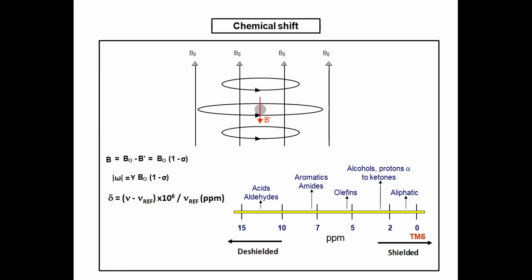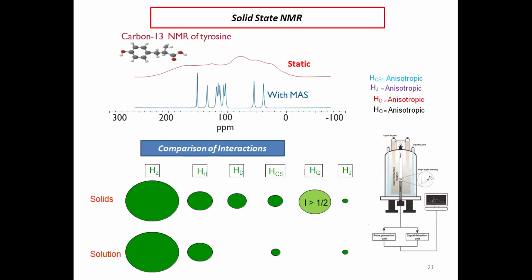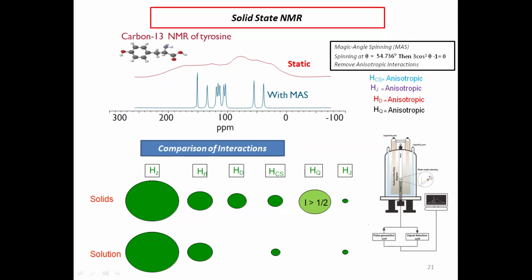So there is another part which I discussed, that was basic, that is applicable to both kinds of NMR, whether it is liquid state or solid state. So there are two kinds of NMR, liquid state and solid state.